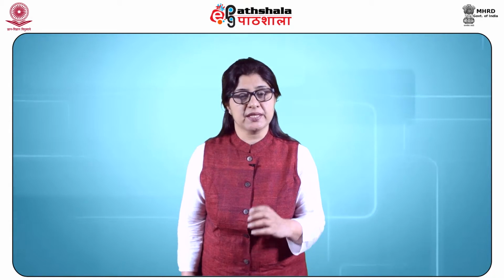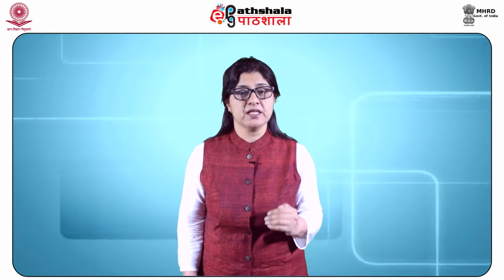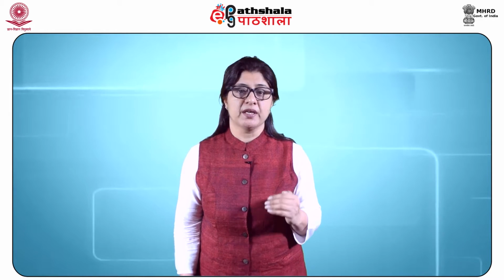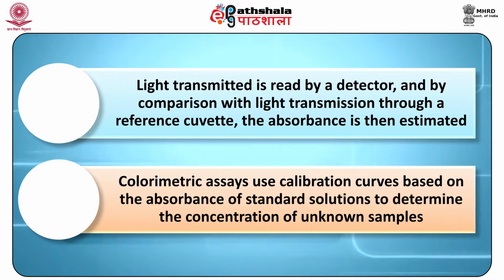Coomassie G-250 dye can bind to proteins and it absorbs more strongly at 595 nanometers. Hence, this particular wavelength is selected for the Bradford assay. The light passes through the sample cuvette and some light is absorbed by the cuvette and its contents. The light transmitted is read by a detector, and by comparison with the light transmission through the reference cuvette, the absorbance is then estimated.